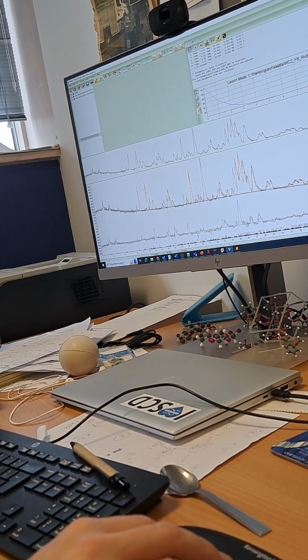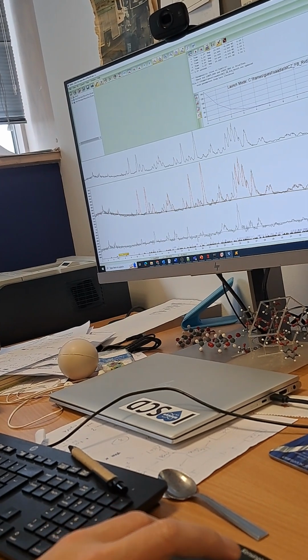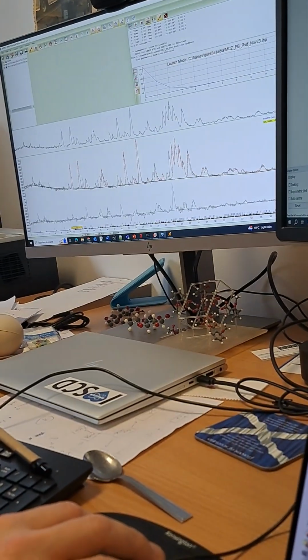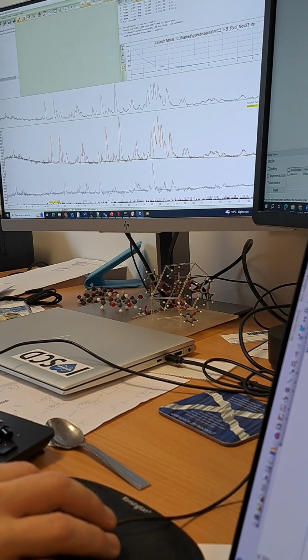Is that a reasonable placement? Actually, it looks pretty good to me. Okay, so let's not do anything yet. If we have a look at this one here, how is that one looking? That's the 0, 3, 3, 1, 1. That is again B and C. Is it corresponding reasonably?